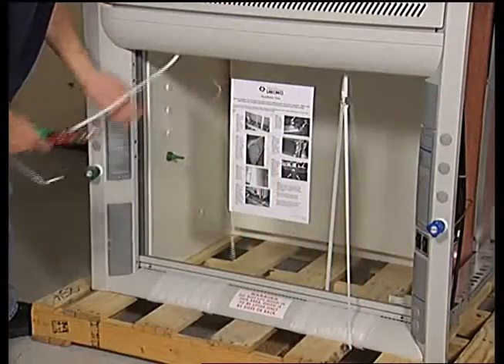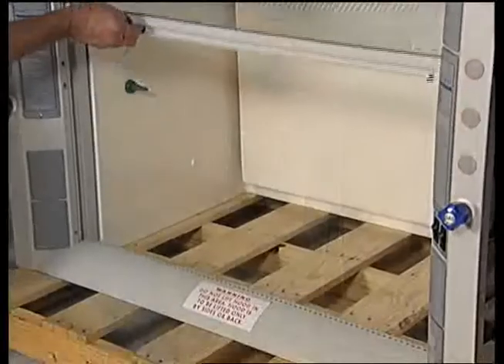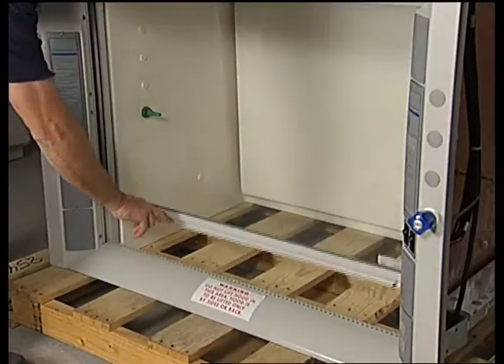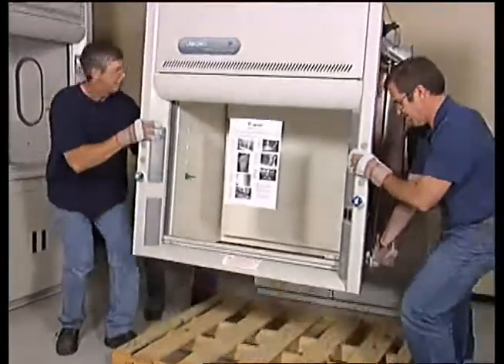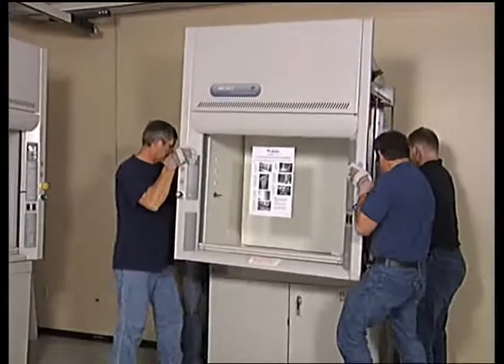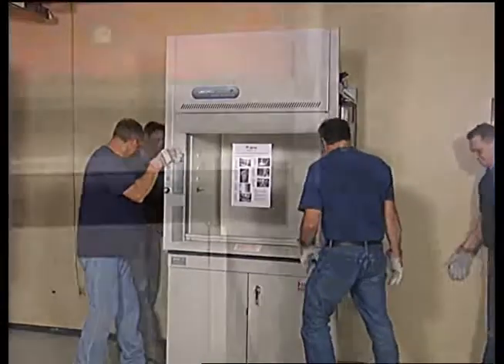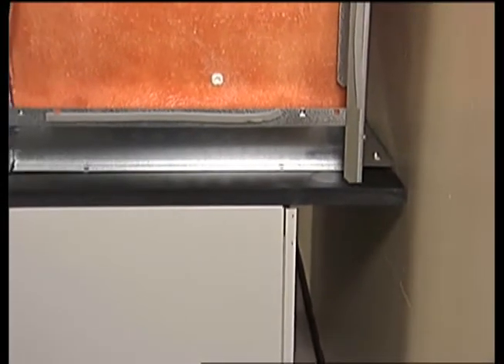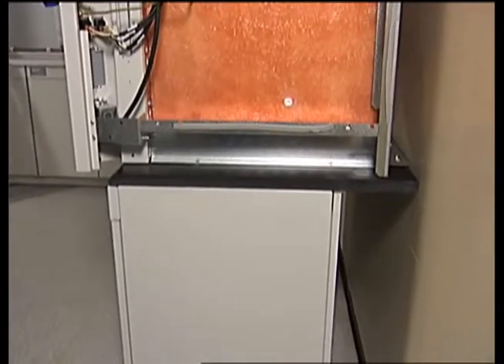Remove the two plastic straps that hold the sash in the closed position. Raise and lower the sash to check for smooth operation. When lifting the hood superstructure, hold the hood only by the side rails and back to avoid any damage to the hood. Do not lift the hood by the airfoil. Place the hood so that the rear angle is flush with the back edge of the work surface. The remaining overhang at the front allows for proper airflow.